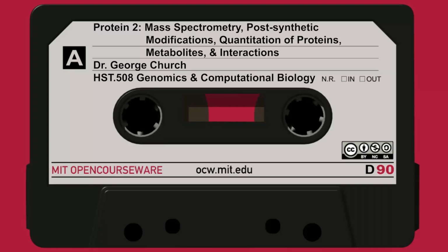Solid phase has a number of different options. The main one we've been talking about, implicitly at least, is the reverse phase, where you have the hydrophobic, say, carbon-18 alkyl chains immobilized to a highly porous media, or in a column that can withstand high pressure, or it can have differing polarities, size exclusion, same sort of things that we were talking about with electrophoresis, except now the force is not an electric field, but it's simply the pressure differential between the injection port and the output.